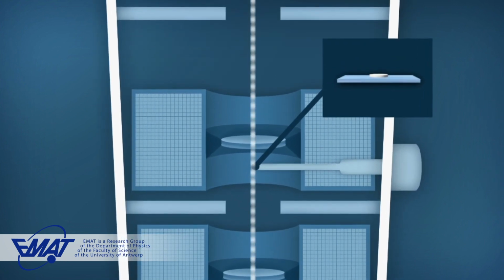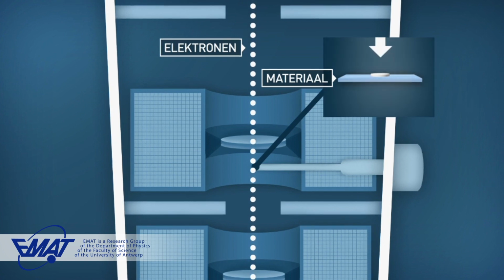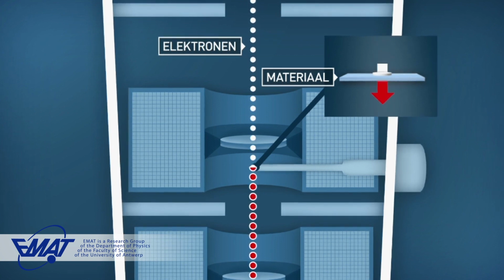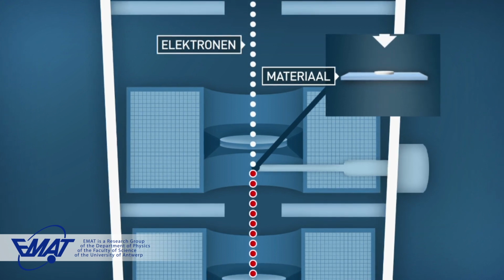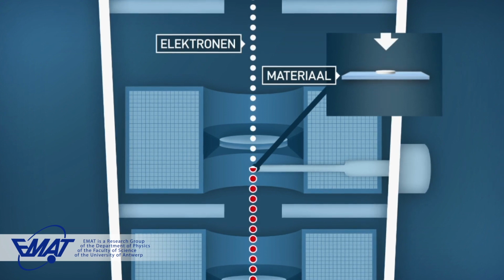In order to be able to look at objects with the quantum, a small specimen, a sample, is taken from the material. In the quantum, electrons are accelerated to very high speed and then projected onto the sample. The electrons pass through the material and store images of the atoms they meet along their way. So the electrons can read the atoms and the structure of the material.